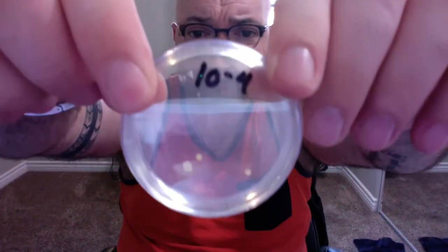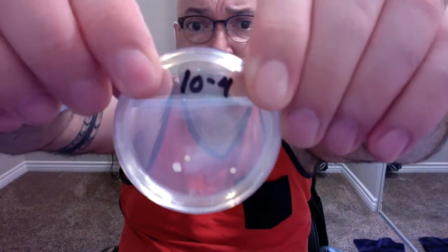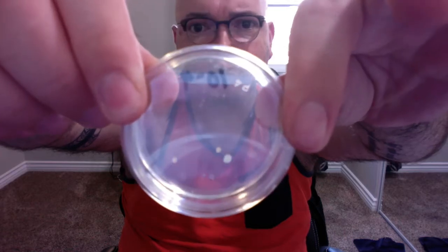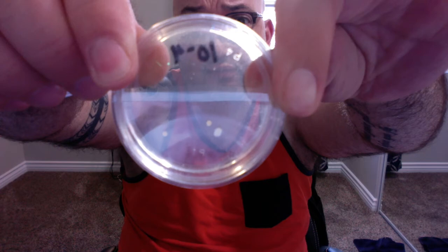So this is number 4. Not very much going on here. It looks like 2 here, 1 here, 1 here. Other than that, there's nothing. So this would be too few to count, or not a viable sample, unfortunately.